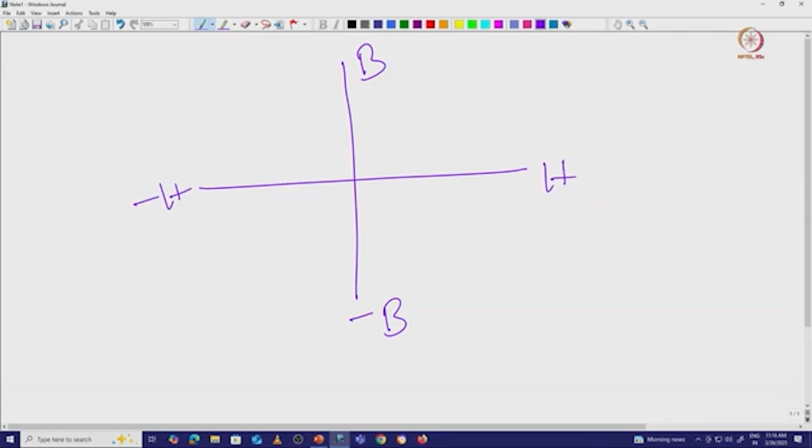So if a metal is following a changing magnetic field, it goes through this path and saturates after a certain time. Then we go in a different direction and change the magnetic field. When we change the magnetic field, it is not going to follow the same path again. It will follow a new path, and then it will come to the saturation point here.